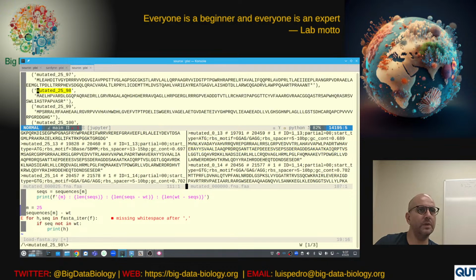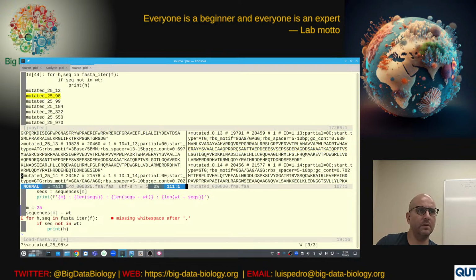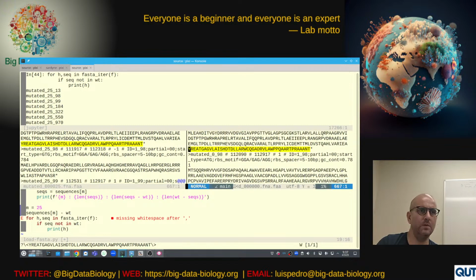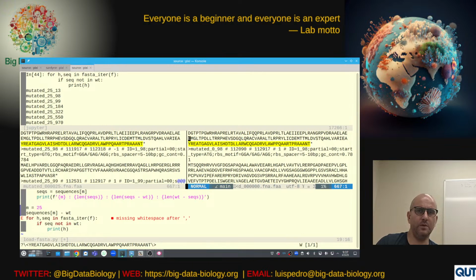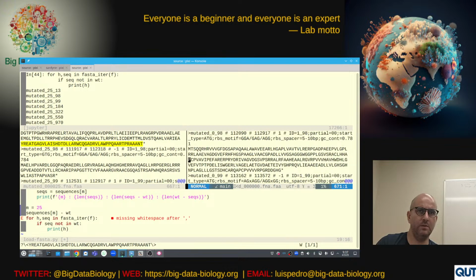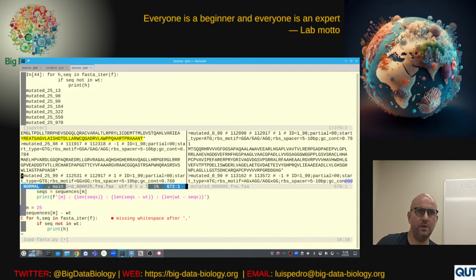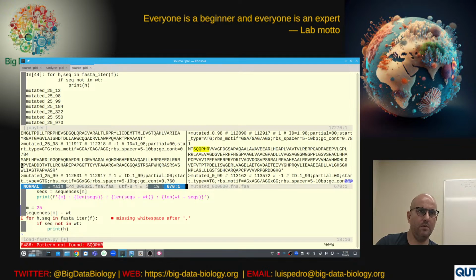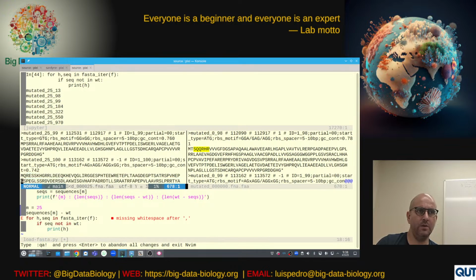Is this the issue, that we get these things? Would this explain what's going on? So here the sequence is good, and then at some point that 98 is completely different, and then 98 is also different.